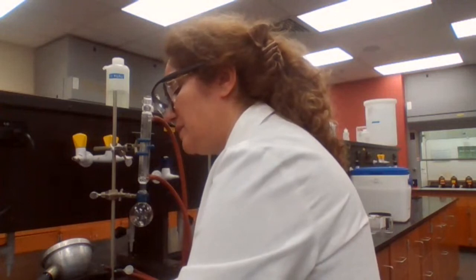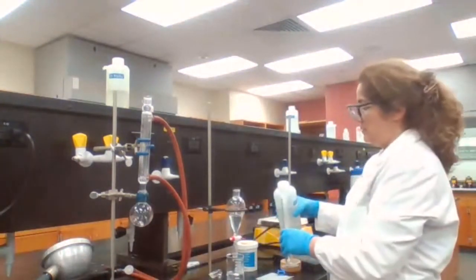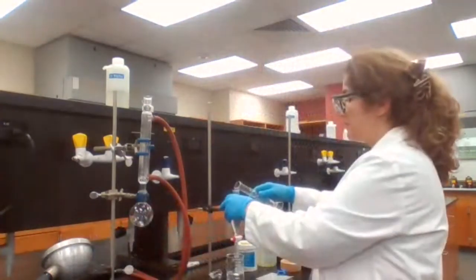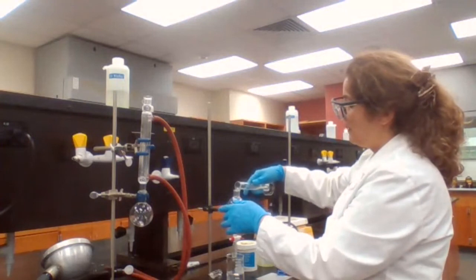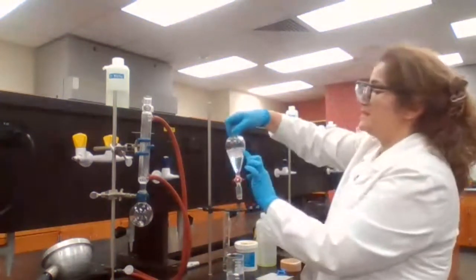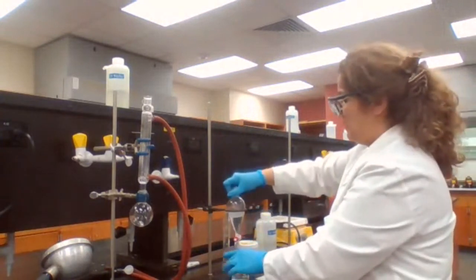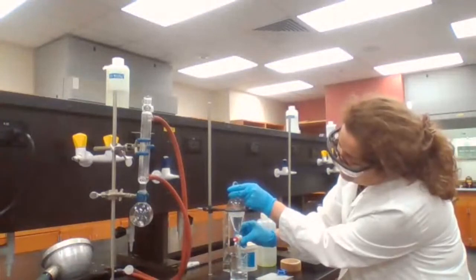Step six, we want to wash the solution with water, and drain off the aqueous layer. Okay, so we add 25 milliliters of water to wash the solution. Washing is basically removing any impurity that is water soluble, and we drain the aqueous layer.